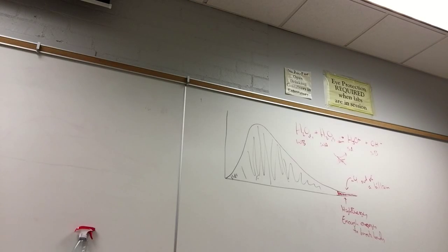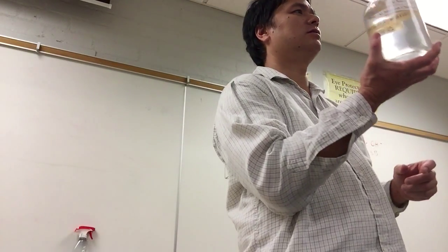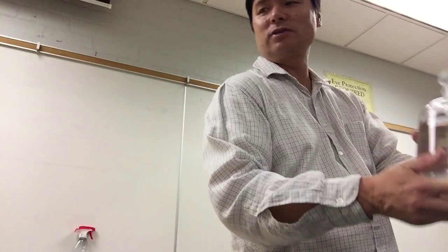The reason we need two definitions is this. Sodium chloride, salt, is that a strong electrolyte, weak electrolyte, or non-electrolyte? It's a strong electrolyte, right? And so strong electrolytes should conduct electricity quite well, right? And so here, this is sodium chloride salt, which should conduct electricity quite well. Let's see, it does. You've probably seen this in Chem 4, I'm sure.